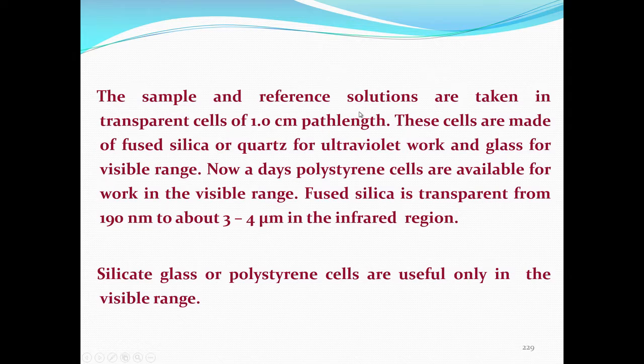That region also you can measure using a spectrophotometric instrument. The only thing is that it will be useful for solids, polymers, leaf samples, reflectance and other related measurements. So, silicate glass or polystyrene are useful only in the visible range.